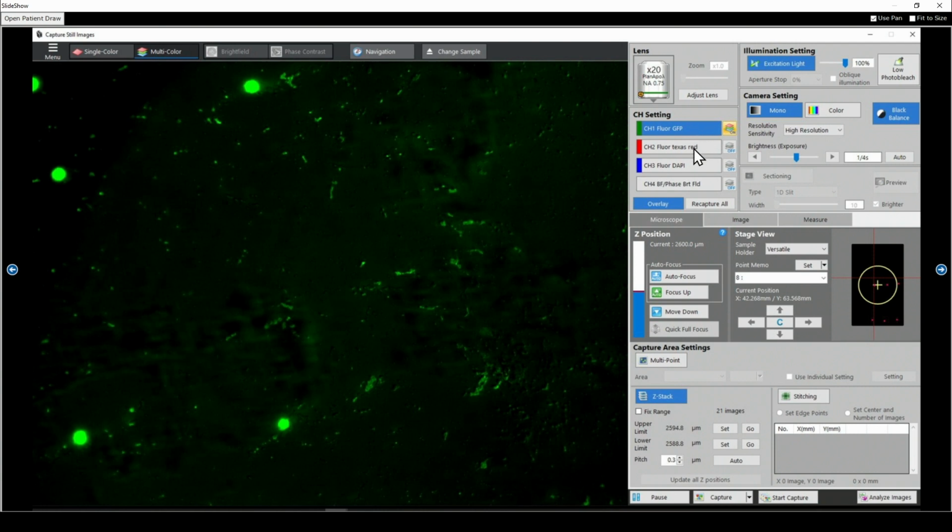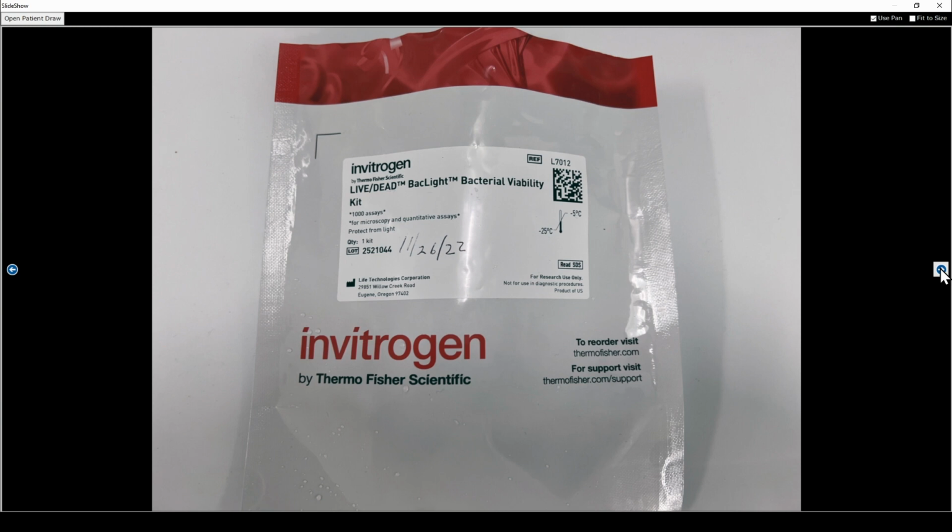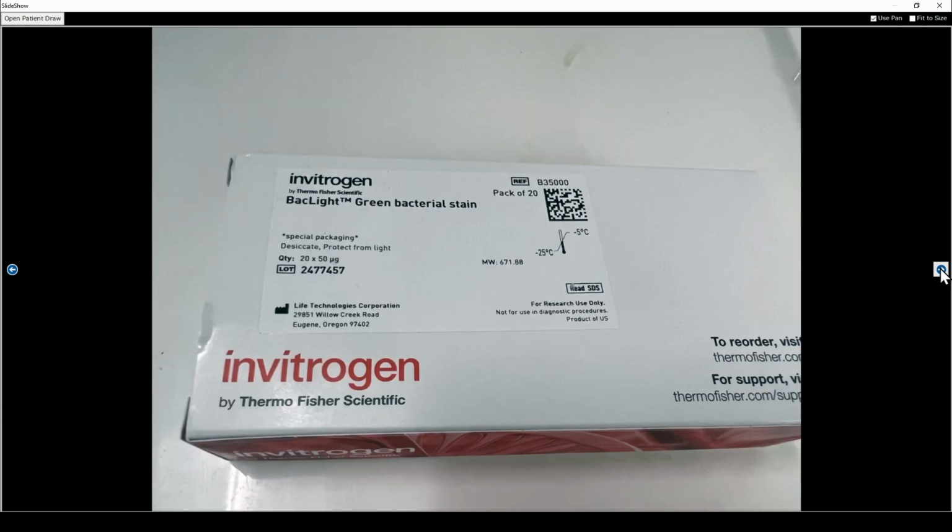The probe can indicate a great many things depending on the probe. This is the interface on the microscope. You do this in layers. The probes themselves are expensive, about $500 or $600 a package. But there are all kinds of different probes that you can use to tag whatever you're particularly interested in.